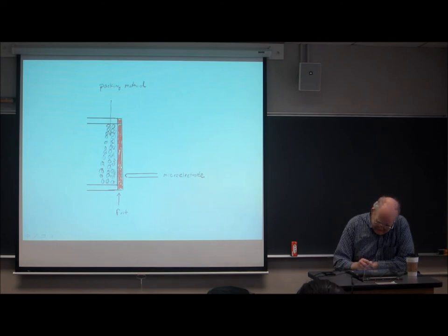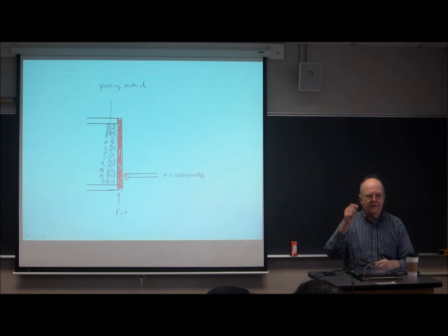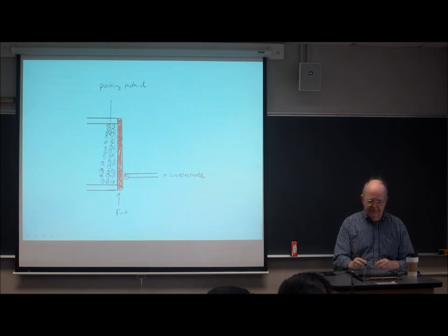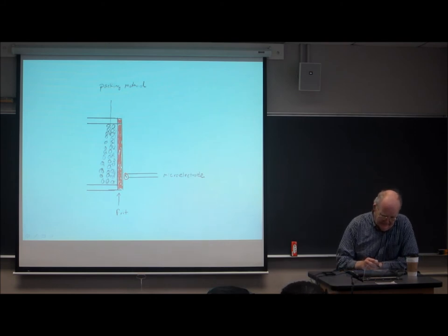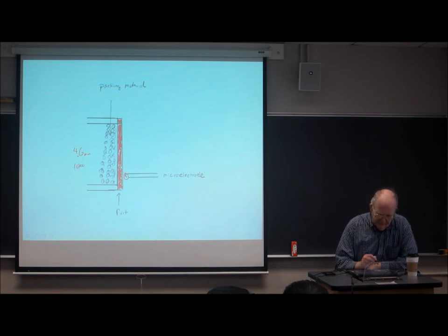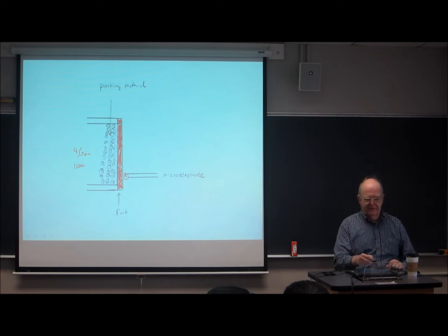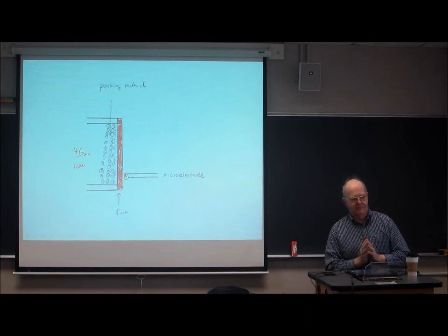And that's the 1 micron diameter tip of an electrode where I can do electrochemistry by setting the potential of this electrode relative to some reference electrode and oxidizing or reducing compounds as they pass the tip. So what he did is he got an HPLC column, the 4.6 millimeter column. And this was a long time ago, so I believe these were 10 micron particles. So you've got yourself a regular HPLC column with particles packed in there. This is the downstream end of the column.